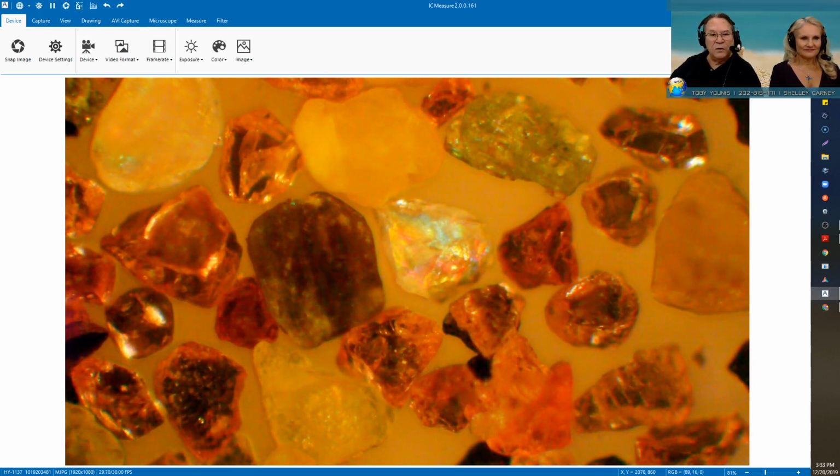I mean, with what little motion I gave it, I put the cup down and gave it a little shake. All I was trying to do was level it out, so I didn't have to worry about focus, and that separated the two colors, the pink from the quartz. So there must be something in the difference. I can't imagine it's all quartz. I would assume it had the same specific gravity, unless the pink pieces have some additional minerals in them. Like the smoky quartz has aluminum in it. I don't know what the pink is. I have to look that up to find out what makes it pink. But I imagine the difference is specific gravity and it's just doing what it does naturally.